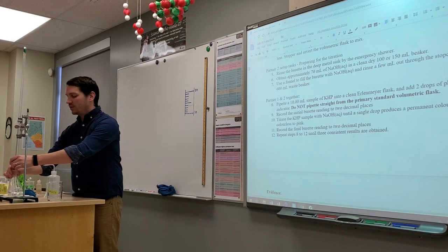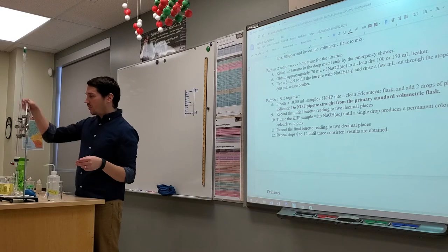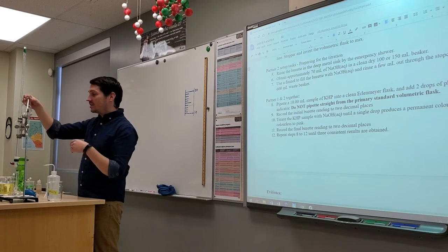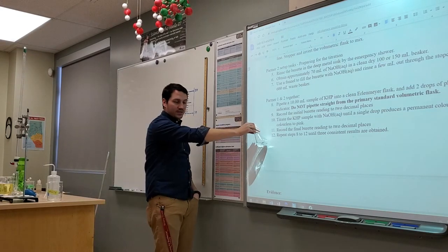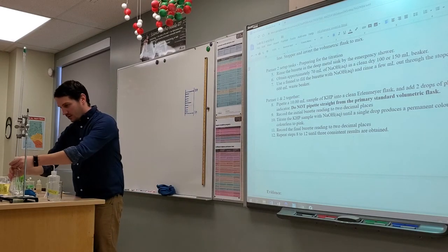I'm gonna keep going, keep going. I kind of know when to stop because I kind of know how much titrant it'll take. Oh, it's starting to turn pink, but as I'm stirring it, it's staying colorless, okay? It's hard for everybody to see at the back, but is this still totally colorless? Yes, it's totally 100% colorless, right? So you gotta add more.